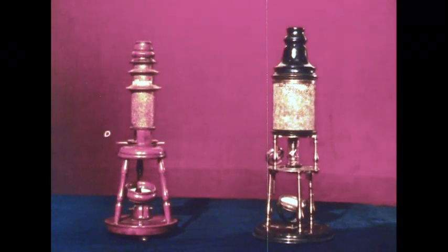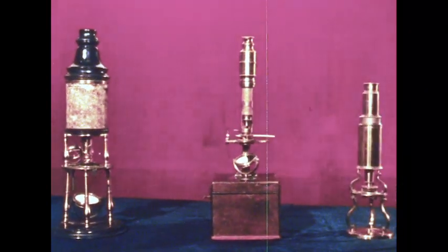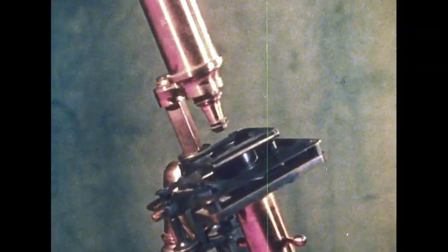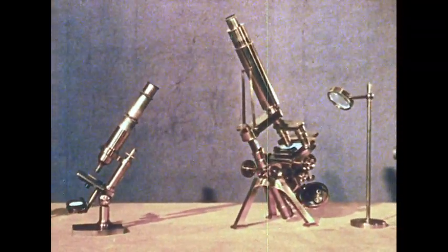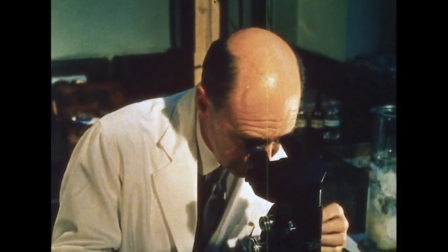These were the beginnings of the light microscope. Over the centuries, its aberrations and distortions were corrected. Magnifications of over 1,000 times became possible. By 1900, the optics of the light microscope were substantially what they are today. The light microscope is still essential to the scientist.